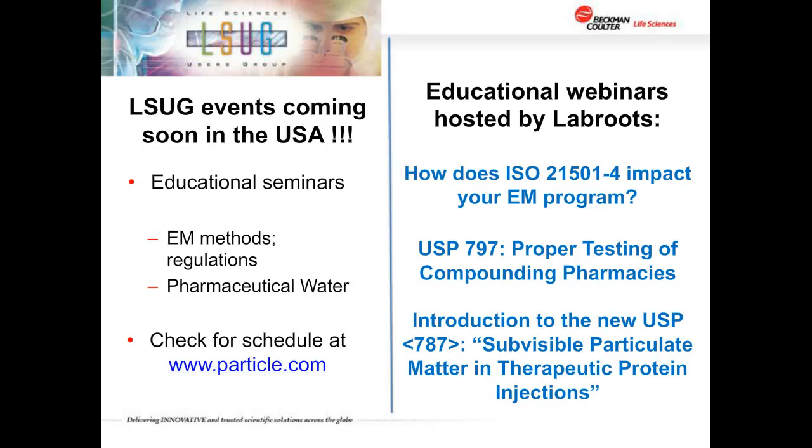Great information there. Next, we have a question from Federico to ask, the particle limits that you showed on the table, are these non-viable particles, viable particles, or both? I suspect the proper answer you could say is both. It isn't specific, and it's basically generally considered in that table to reference from the pharmaceutical world non-viable particles. But truthfully, I think a better title is total, in that anything that's in the air, be it living or not living, or be it viable, that is able to reproduce or not, to the particle counter and to the table is not significant.